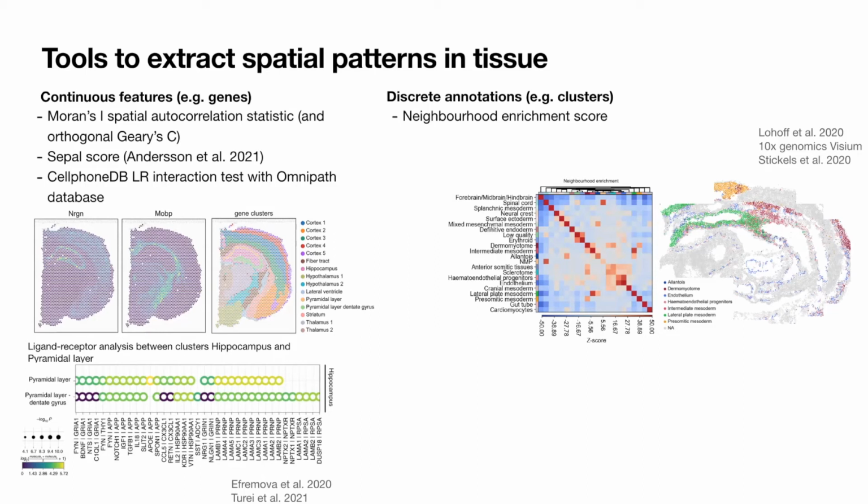yeah, essentially you can see that some of these clusters, I highlighted some of them on the right-hand side in the actual spatial image, and you can see that these clusters are ones that are kind of scored as being enriched for each other.